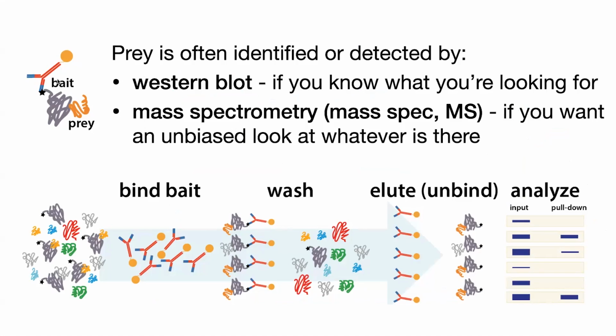So are you trying to answer, we know that these interact, but which parts of the protein are important for interacting? Or we know that they interact, but does this interaction differ between different cell types? These are different types of questions that you could be asking in cells, or in just purified components, or just in the lysate. So lots of variations and lots of options.